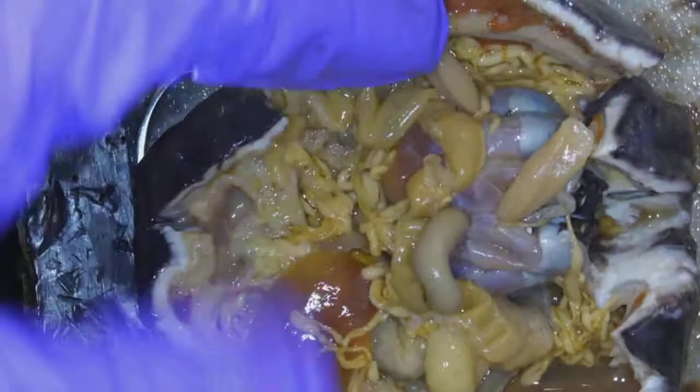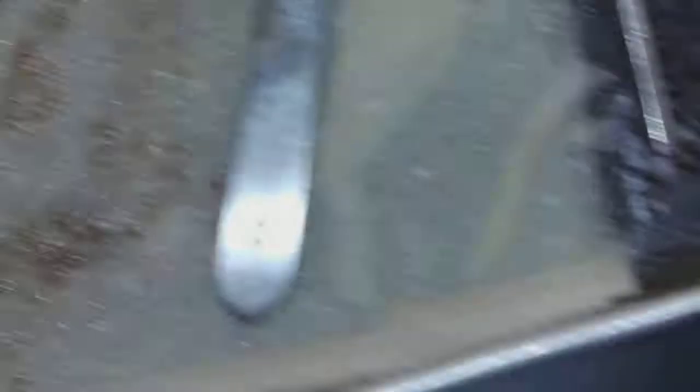So the structures to know are: longitudinal muscles, intestine, stomach, gonads, and respiratory tree. Maybe if I float it and point to it — name this structure — you could identify the respiratory tree. And that's all we need to know for Holothuroidea, the sea cucumber.